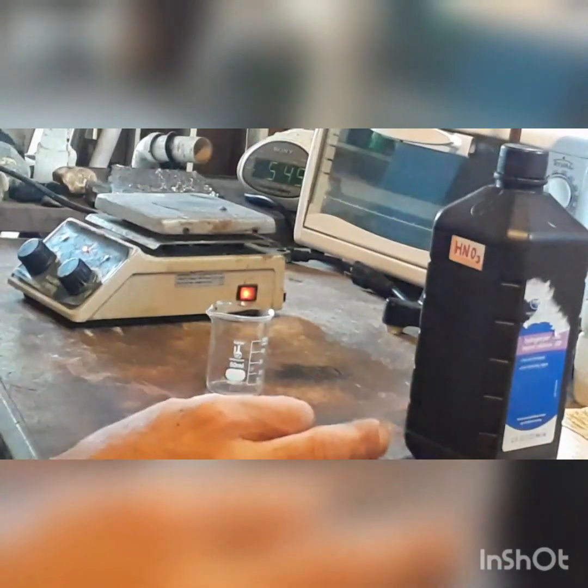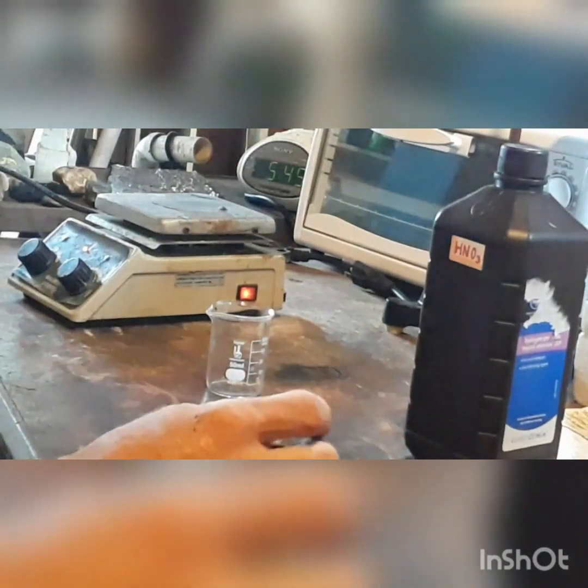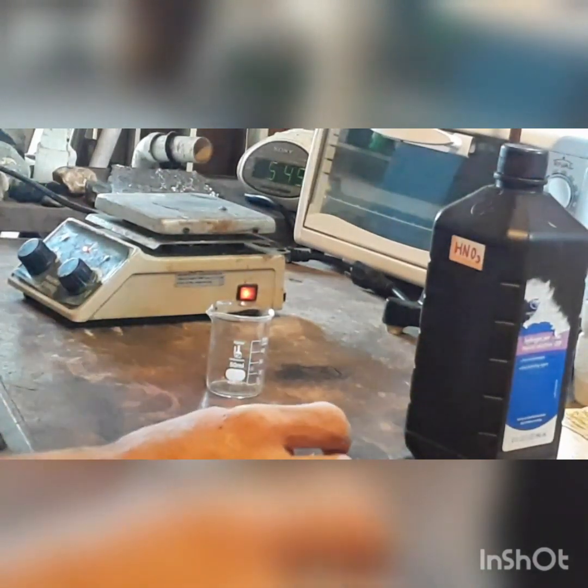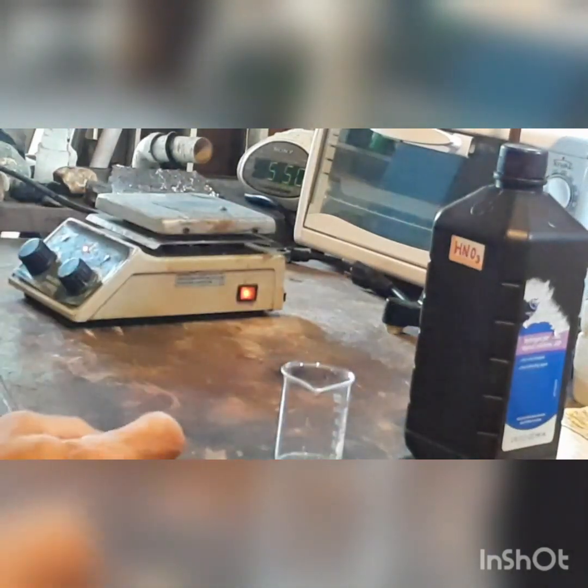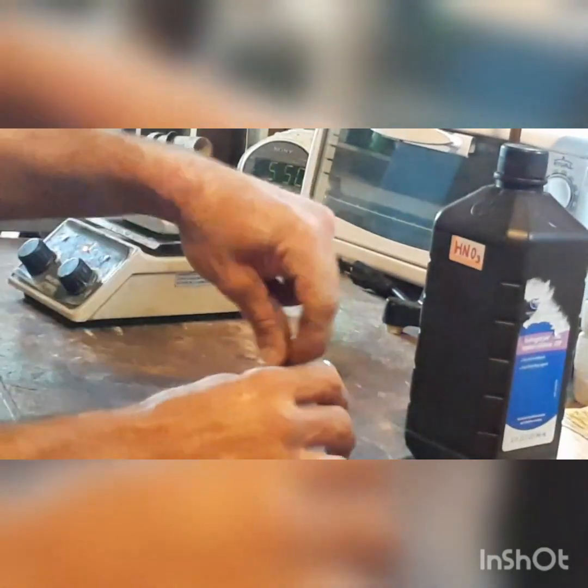You need some elemental lead, which I have right here — this is about 20 grams. You don't need to worry about having stoichiometric amounts for this reaction because you can always add more nitric acid later. We just need a vessel to put it in; I'm going to use this little beaker here. The first thing we want to do is put in our lead very carefully because it does weigh a good bit, and we don't want it to break our beaker.